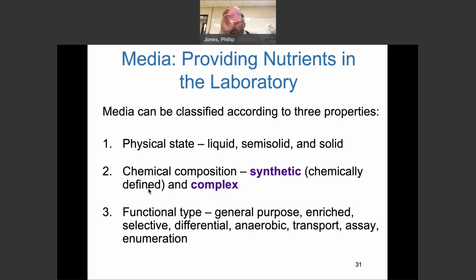It's also differential because Staph aureus turned this pink media yellow. If you look on the edge here, maybe you can see a little bit of pink. All right, so it literally consumed all the mannitol alcohol sugar out of the plate.